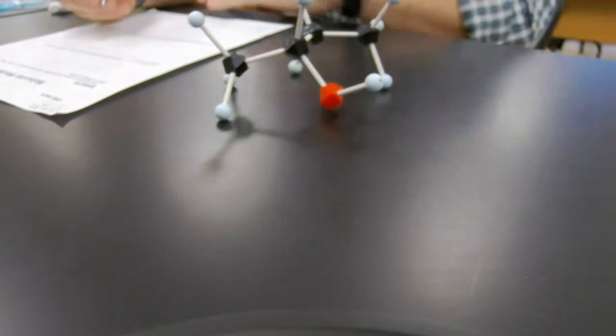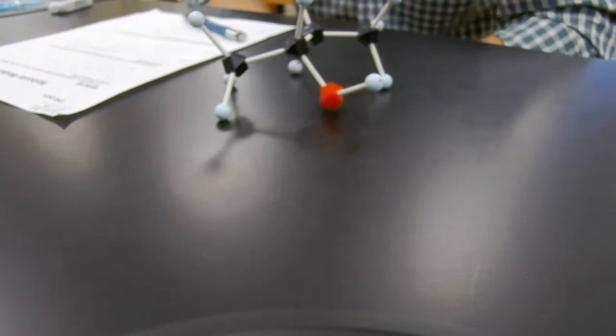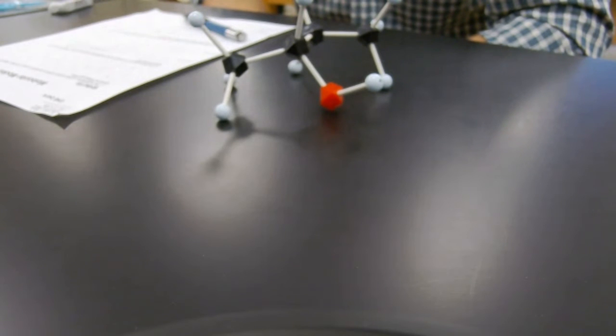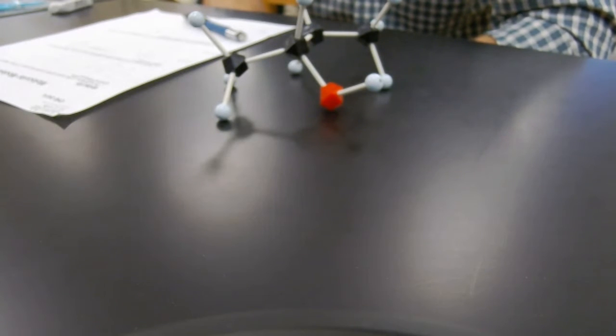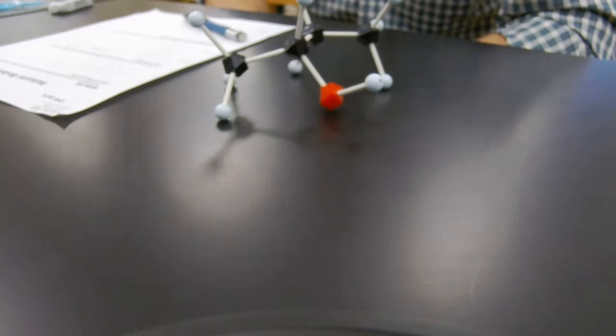Now I can do a couple of simple operations on this. I can change the way that it's displayed. This model is currently what we would call ball and spoke, or ball and stick. If I move to space filling from the model drop-down menu, this is how much space those atoms are occupying. There's a central carbon, and this big balloon is the iodine. This other giant balloon is the bromine. The iodine is giant, bromine is big, and the chlorine is big, and there's the puny little hydrogen right here with its little stubby bond. We can actually measure those. I'm going to go back to ball and spoke because it's the most appealing.